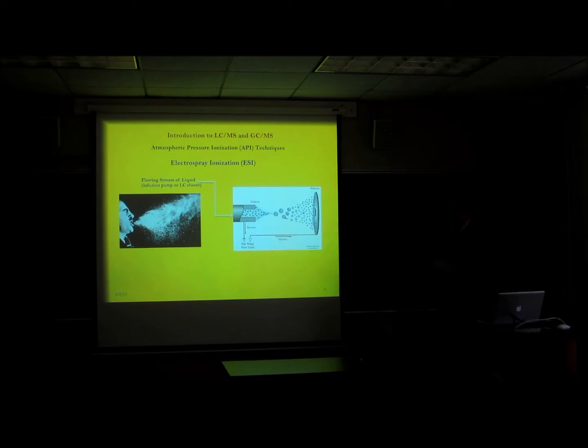And he later won the Nobel Prize for this because it really revolutionized bioanalytical mass spectrometry and allowed for the first time very routine, directly combined liquid chromatography mass spectrometry. And the reason for this is that electrospray ionization represents a technique that relies on a flowing stream of liquid from an infusion pump or the eluent right off of an LC to form ions. So it's perfectly compatible with liquid chromatography.